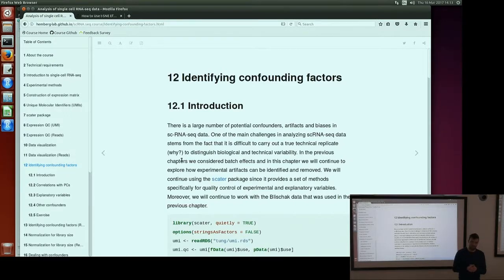Having said that, there are certain things we can expect. Batch effects are an aspect that we have to face across all aspects of genomics and beyond. It was true of microarrays, that if you processed the same samples on different microarrays on different days with different ozone levels and all the rest, then you would see batch effects evident in the measured results. The same was true for bulk RNA-seq samples processed at different times by different people in different labs.